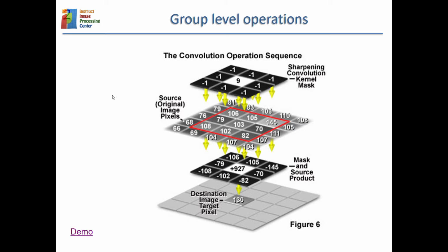So when you come out on the right, I take the leftmost pixel and I use it as if it was on the right. This is equivalent to taking the underlying black image and repeating it infinitely on the right, on the left, on the top, on the bottom, and so on. And actually that repetition is what the Fourier transform is doing. The Fourier transform assumes that the input image is repeated periodically over space. Okay, so this is convolution.